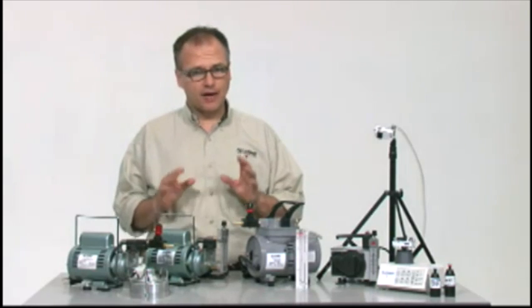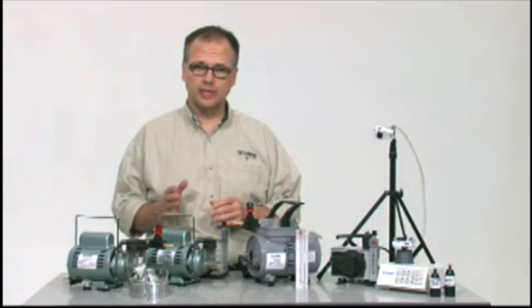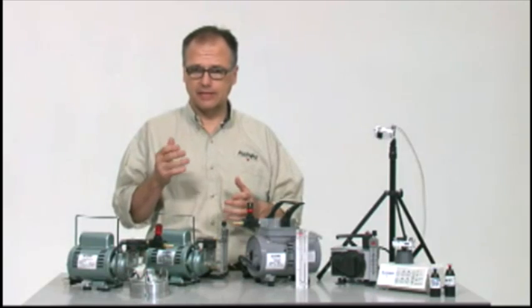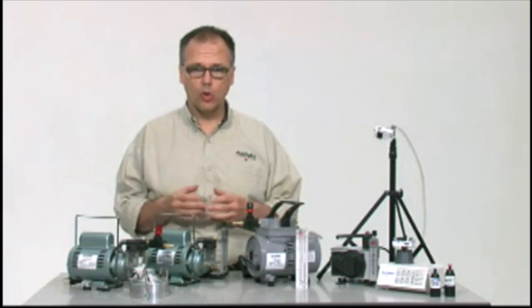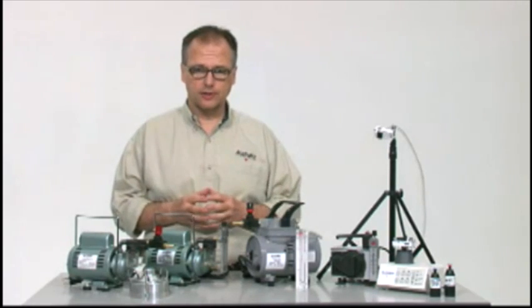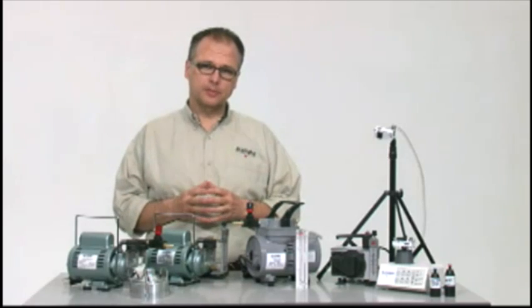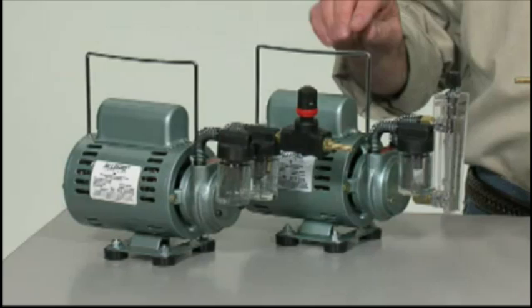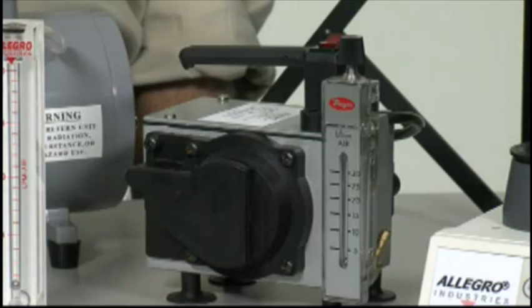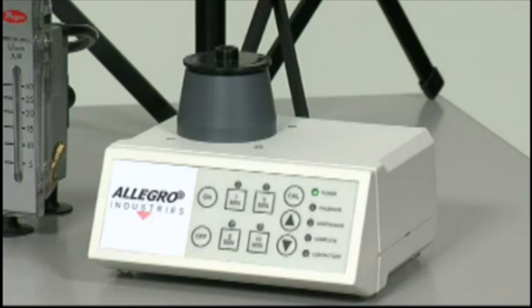Allegro offers a wide variety of high volume sampling pumps for use in collecting air samples containing asbestos, lead, mold and various dust and particles. With the widest range of pumps in the industry, we can provide rotary vane, diaphragm, linear and even DC powered units. If you need to collect an area sample, we can help you find the right pump.